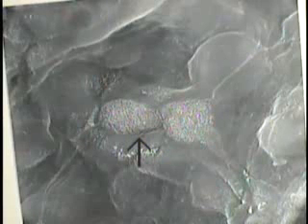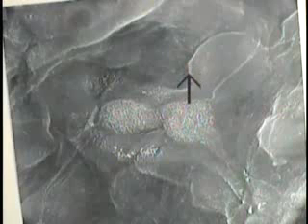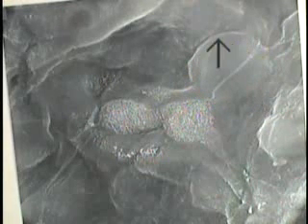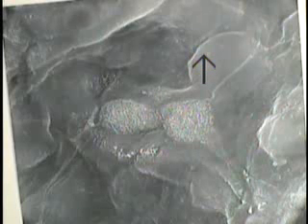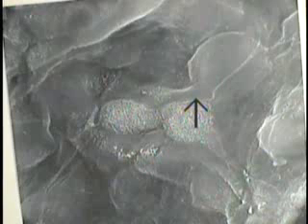What's interesting in this electron micrograph is this structure here. This is the outline of an erythrocyte, or a red blood cell, coursing in the capillaries beneath the alveolar wall, or within the alveolar wall, beneath the type 1 epithelium and beneath, obviously, an endothelial cell.